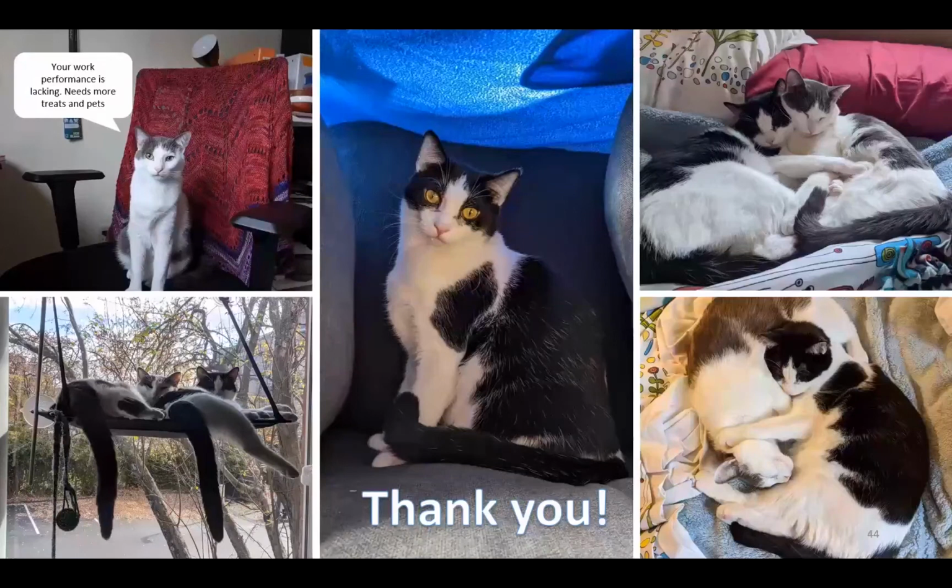Right. So that is obviously a difficult question to answer. Because we are not taking straight up videos of worms, we're taking snapshots of the worm every couple hours. There are systems that allow you to take videos of worms, it's just difficult to do that at the scale that we have. There are people who do videos of hundreds of worms, almost like a 96 well plate, so you don't get the same sort of microscopic resolution that we do. It's a trade-off, right? You can either take video or you can take snapshots. We chose to take snapshots, but with higher resolution, higher magnification images.